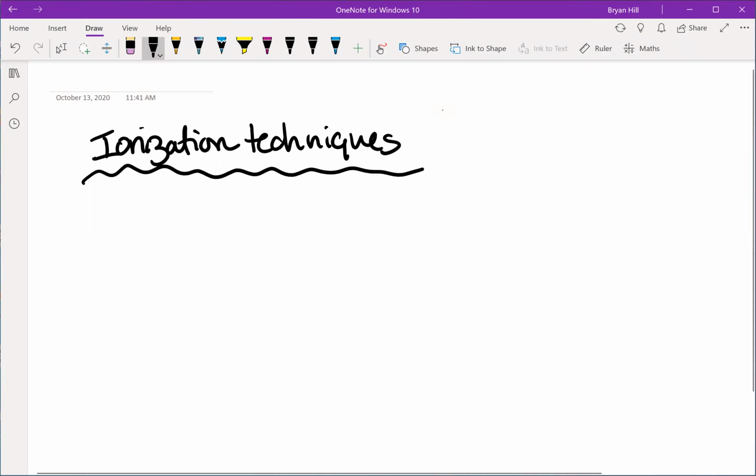Anybody? There were a couple of them. Like SIMS, FAB, and MALDI.